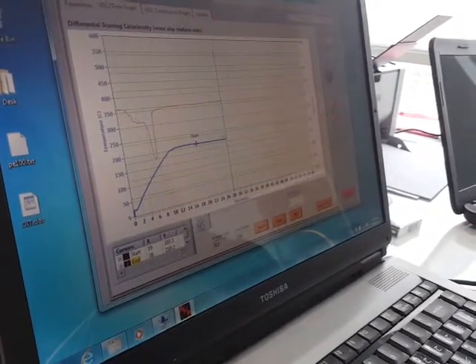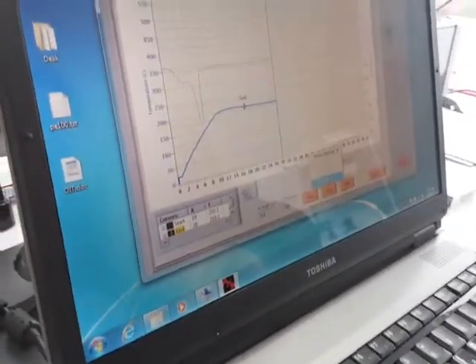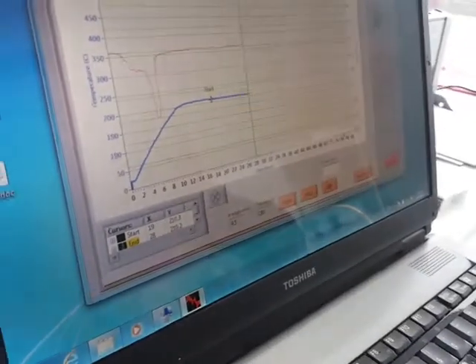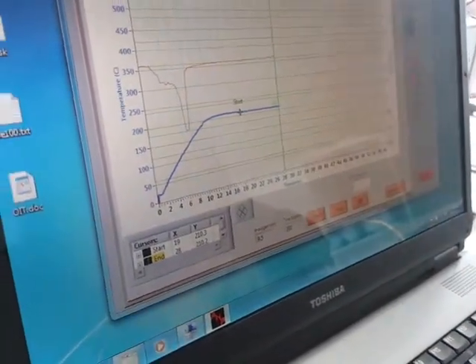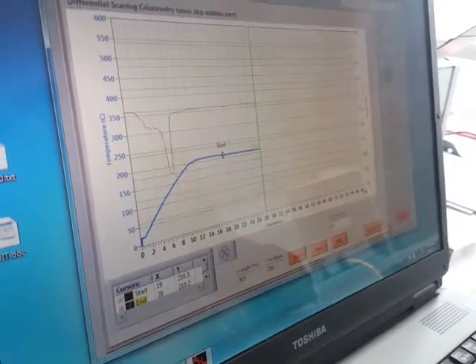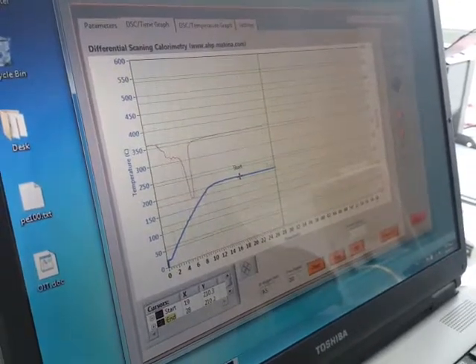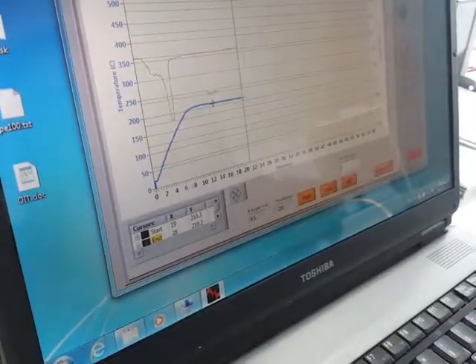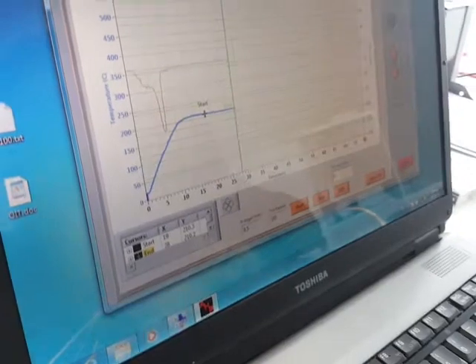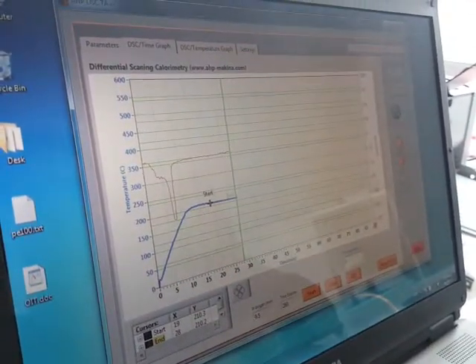You can also easily change the mode of the time. You can put it in auto scale X. The horizontal axis will automatically expand when the time passes the maximum value, or if you want to change it manually, you can. It's in the unit of minutes. The operator can easily change the maximum value.